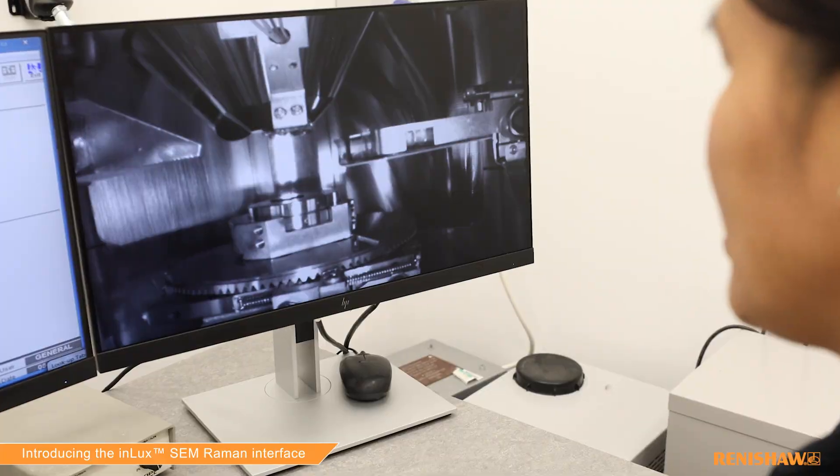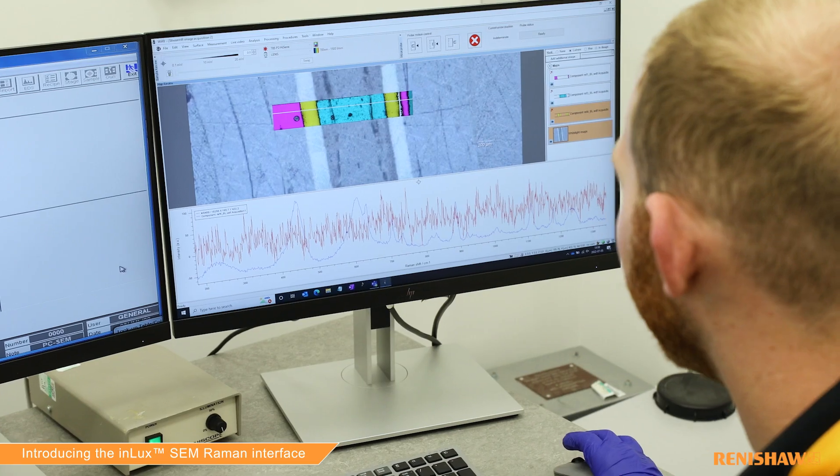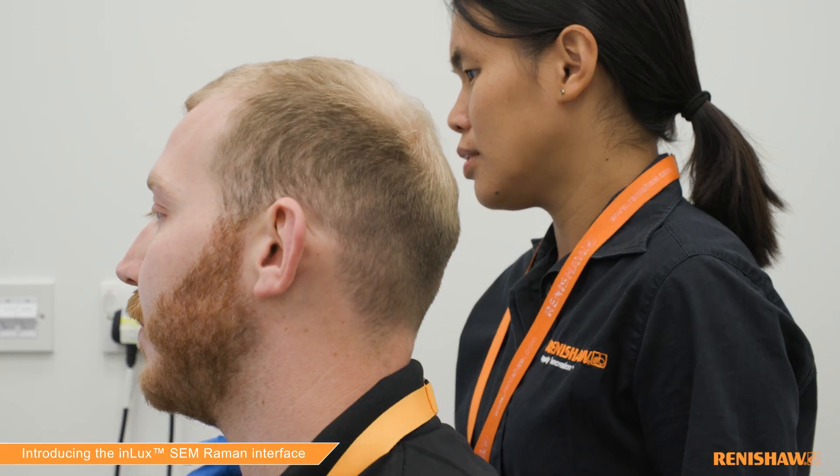We have improved white light imaging over our previous offering, allowing you to have three forms of imaging in your SEM: the SEM imaging, the white light, and the Raman. It also allows complete co-localization — we can take the measurements simultaneously, so you can be confident that your Raman data and your SEM data are from exactly the same location.